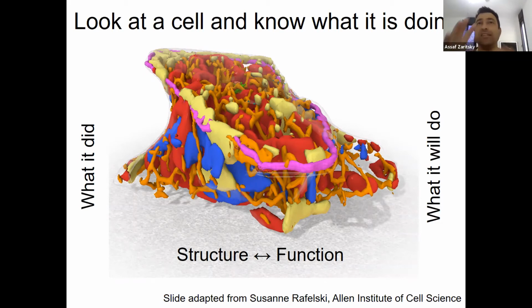cell. And it's a technical limitation because the molecular biology is difficult, trying to tag all of these fluorescent molecules to each of the cells. And then also the optics is different because you image your cells and there are wavelengths that are interfering with one another. And then you need to computationally resolve them. So it's really a huge limitation.